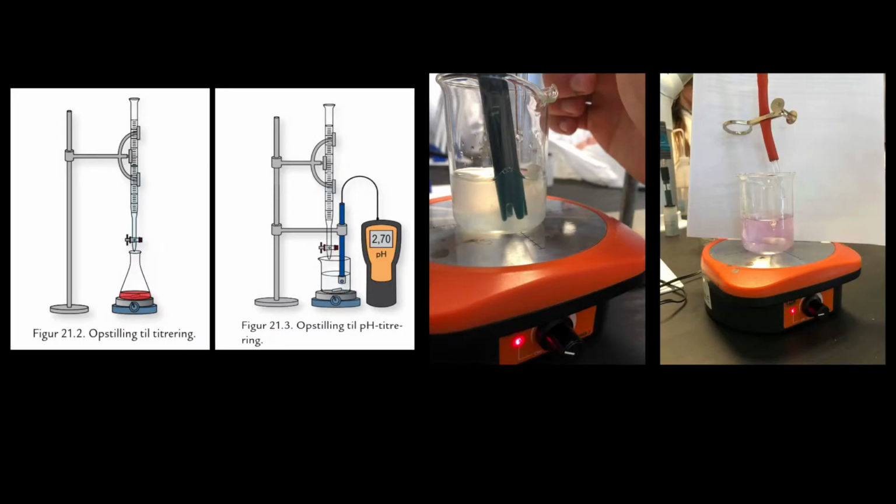In this experiment called the concentration of citric acid in lime juice, we wanted to calculate the concentration of citric acid in lime juice, and to discuss why we can say that there is citric acid in lime juice. We did this by doing a titration. We did 4 different titrations.